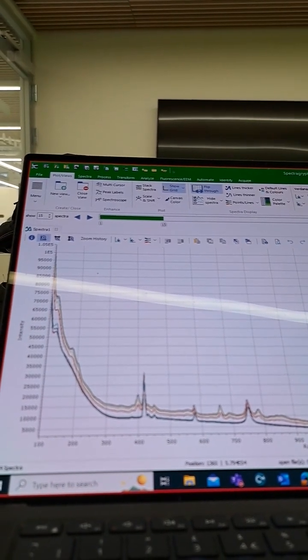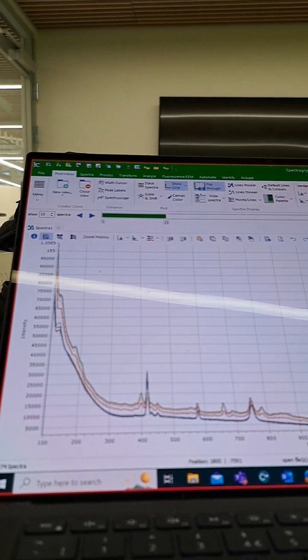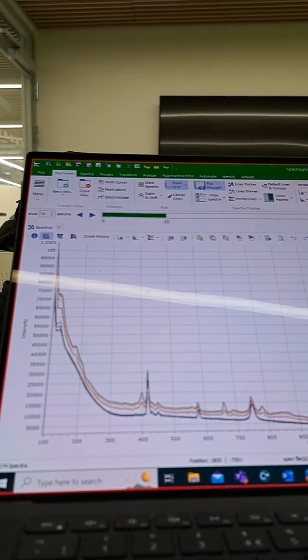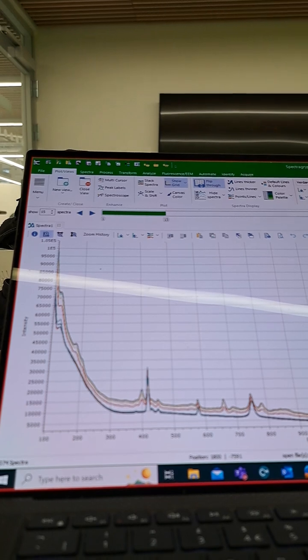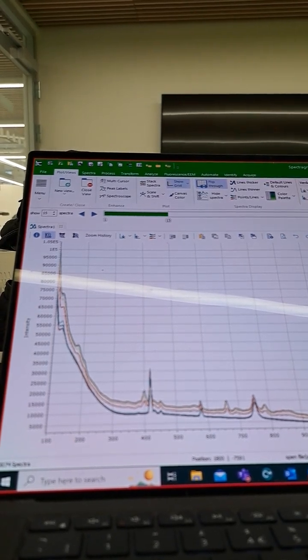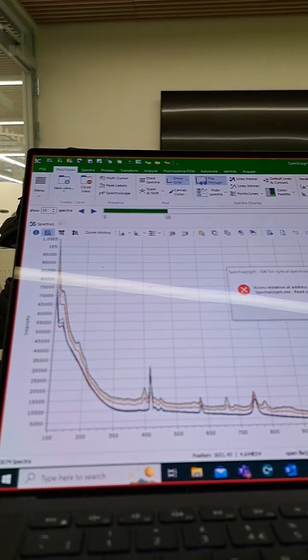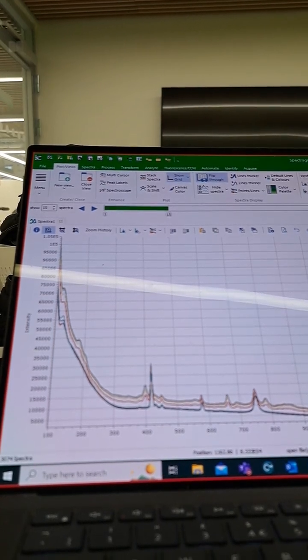So do you know from 20 hours onwards, this number? No. Well, you need to find that out. Okay. You need to know which spectra are the ones of interest.